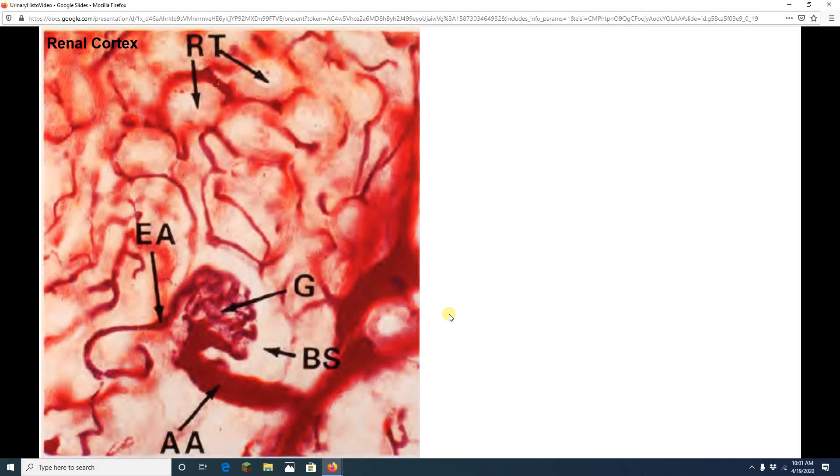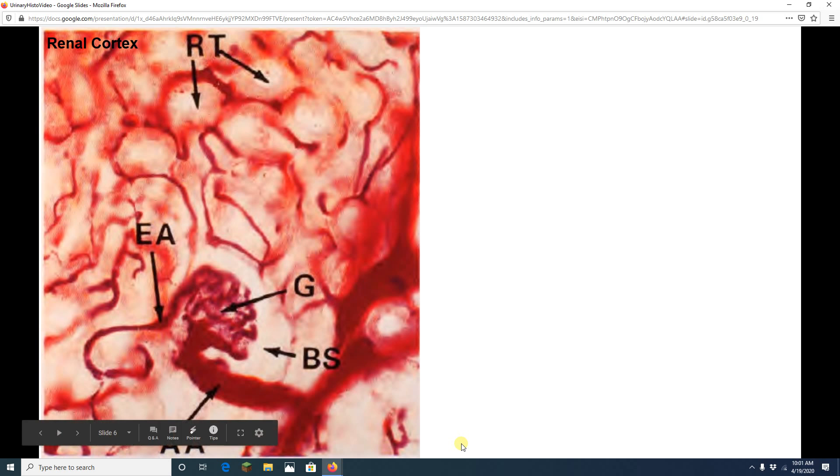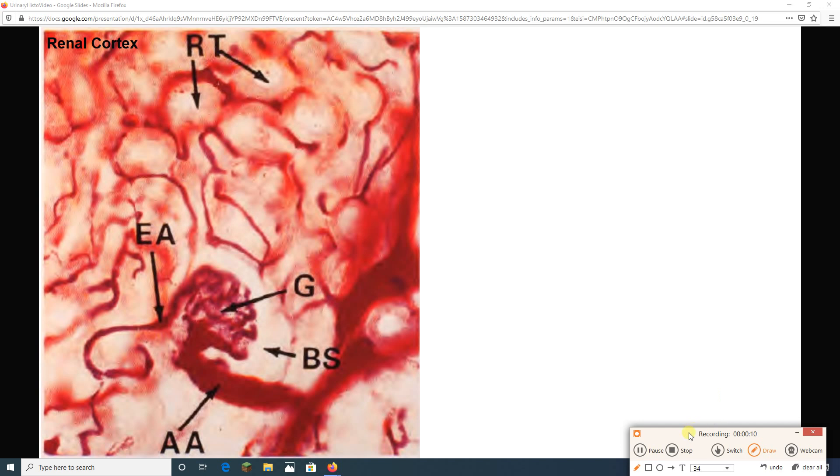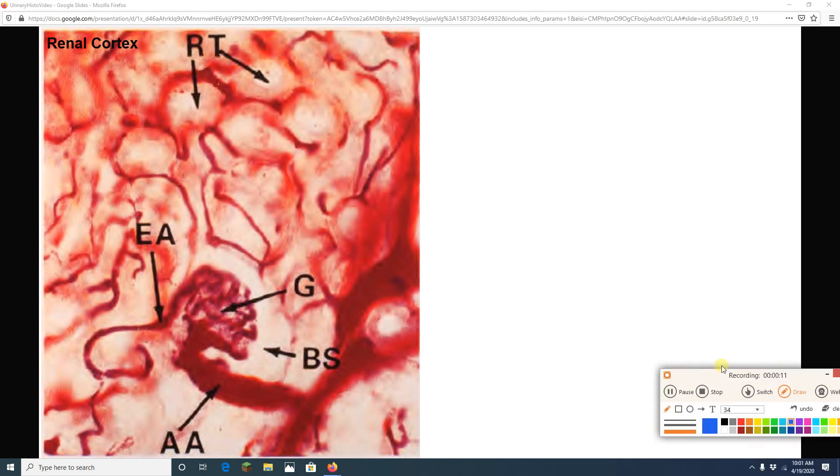Hey guys, back for another video of urinary system histology. I almost finished the kidney last time on the first one. Didn't quite do it. Got really close though. One slide.